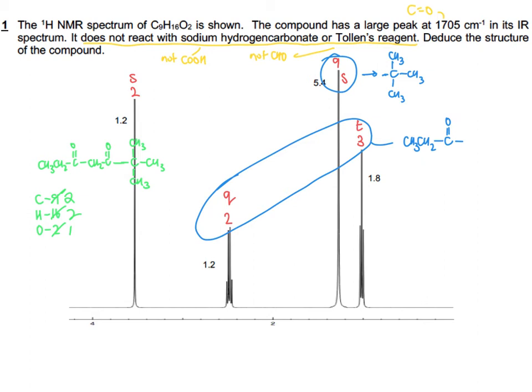That would explain why we have a chemical shift of above 3 when our data sheet says next to a carbonyl should be 2.1 to 2.6. Here we're next to two carbonyls. That would give a greater shift. But that, anyway, is now our full molecule.